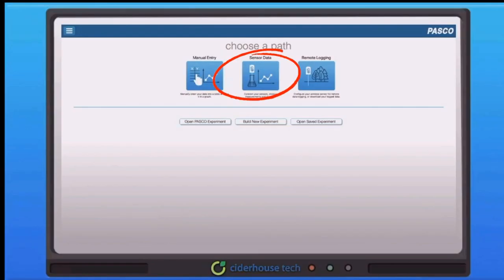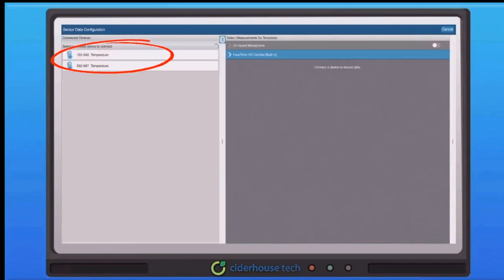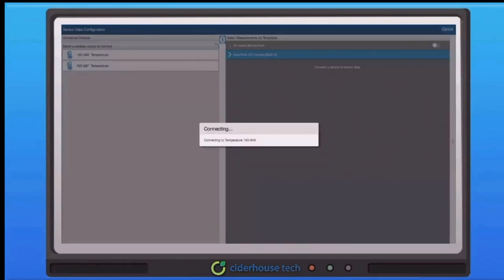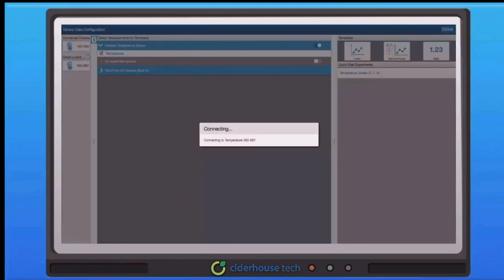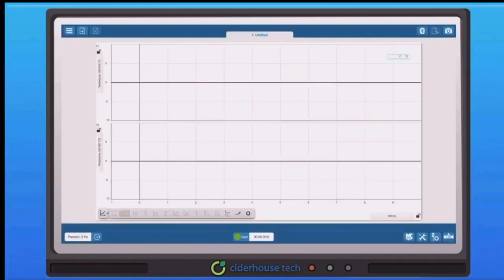First, we need to select the sensor data screen. From here, both sensors need to be paired individually. Please take note that both sensors have been selected. We will now select the graph template. As you can observe, there are, by default, 2 plot areas. Both sets of data will appear on separate graphs.